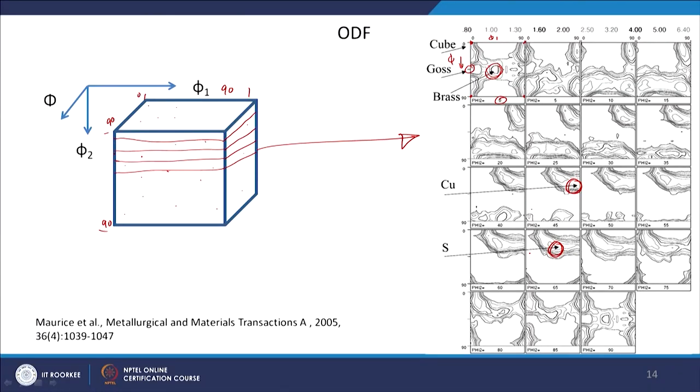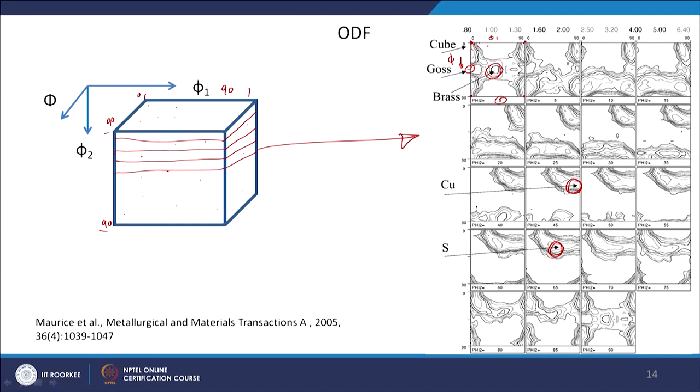Okay. So, this is how you can use different representations of texture to understand how the grain is oriented, or if more than one grain is oriented, then I can get intensities like these contours. So these can be plotted as a discrete plot also, you can show as points, or you can do some kind of interpolation using some mathematical function, and then you can plot contours, okay. So when the contours are more, or their numbers are more, that means that it is that much more intense, and that will be able to give you the particular information about the texture, okay.